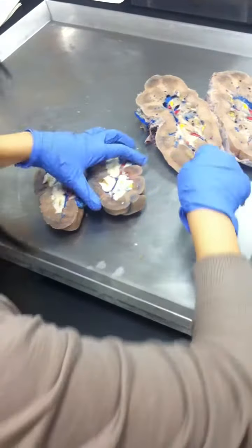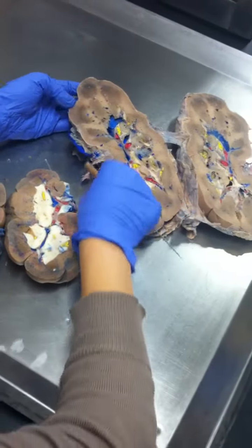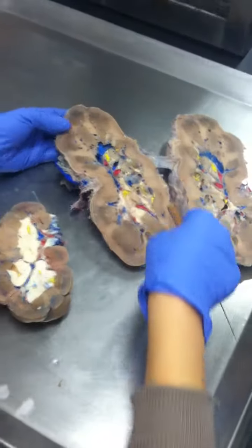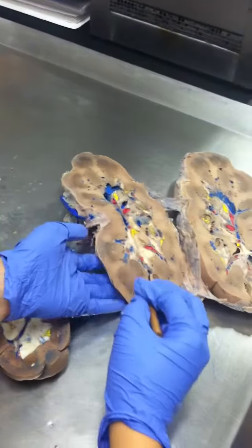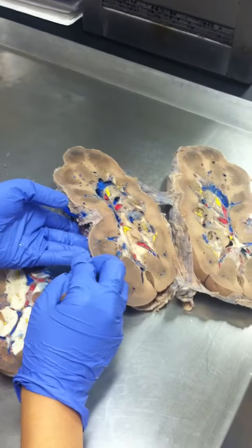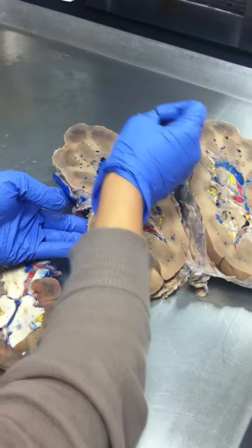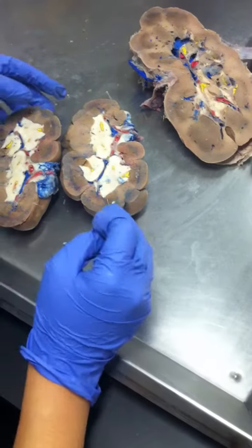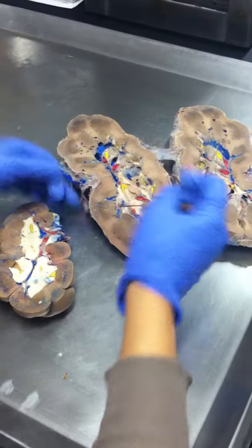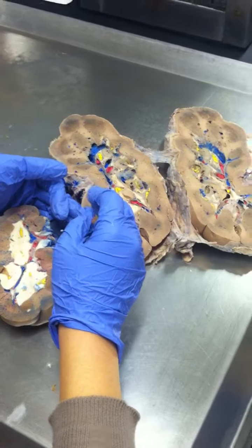All right. See this outer lining? This outer region of the kidney is called what? The cortex. So everything inside would then be the medulla, right? See how this right here sort of forms a pyramid-ish shape? See all these darker spots? The darker spots make up this pyramid-ish shape, right? So that's the renal pyramid.